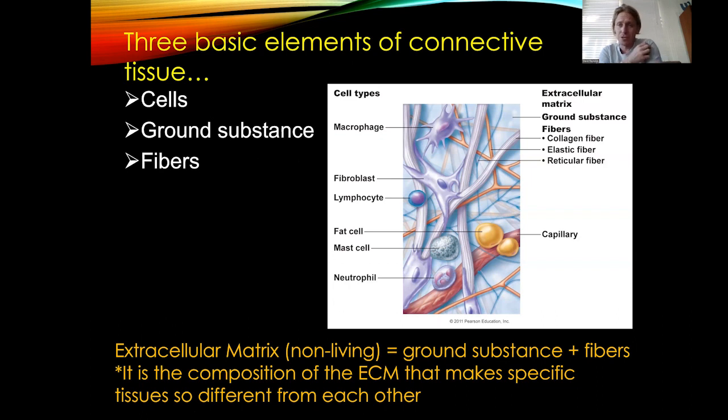All right, so this is a good illustration to kind of show you what we mean by non-living extracellular matrix. So here's one of the connective tissue cells here. Okay, it is living in this matrix that was created here. So all of these are different types of proteins that are making these fibers. And so they're kind of living in this matrix of these protein fibers.